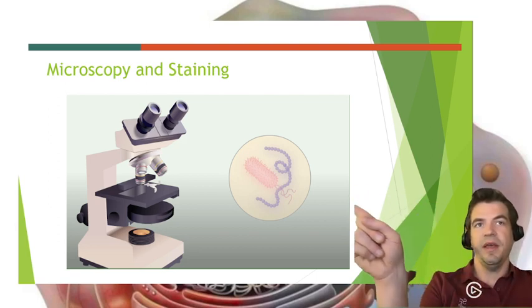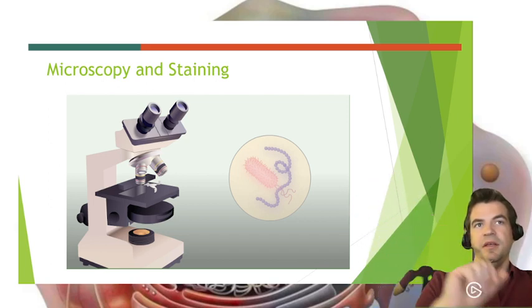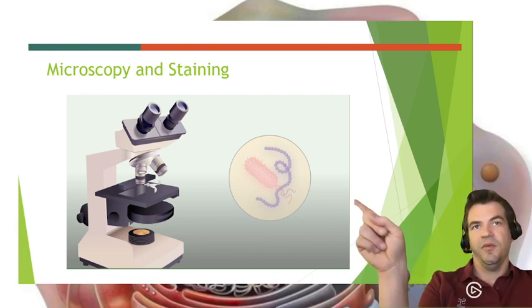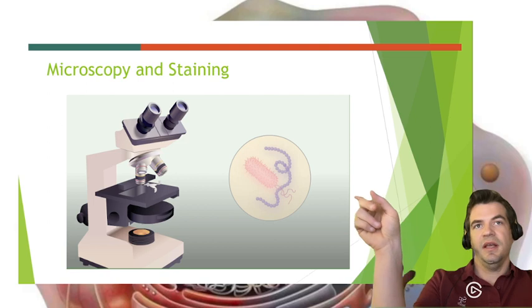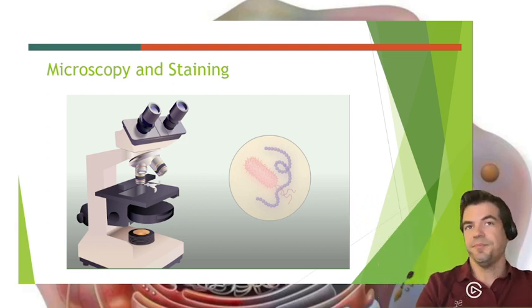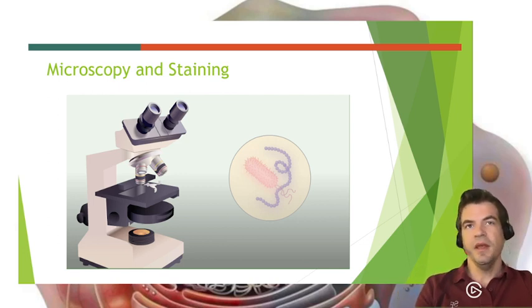Then we have a long chain of coccus, that would be streptococcus. So that's a gram-positive streptococcus and a gram-negative bacillus with flagella and fimbriae. Remember, those are fimbriae, not cilia, because they are bacteria.